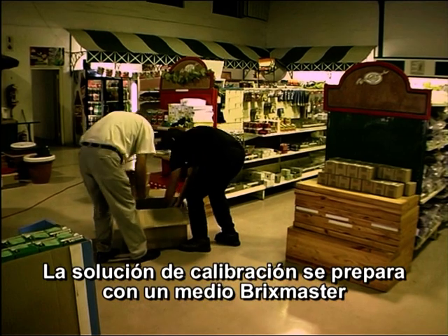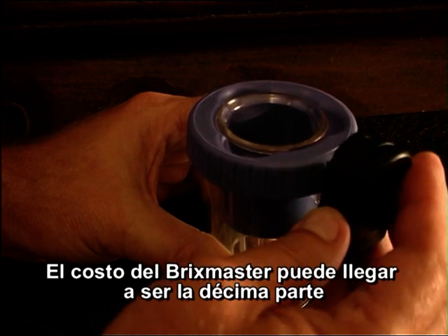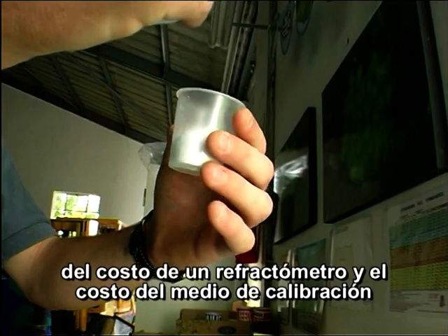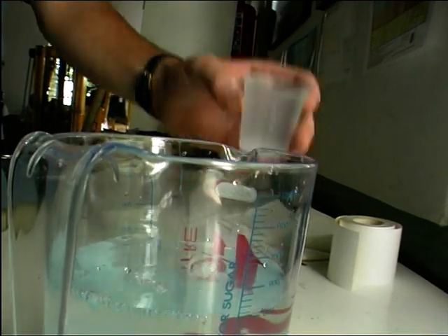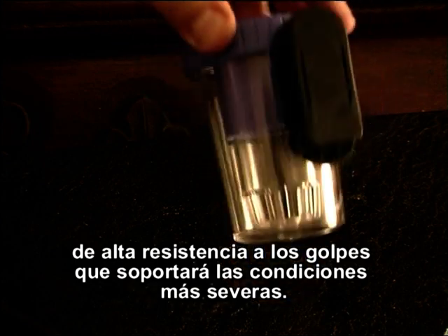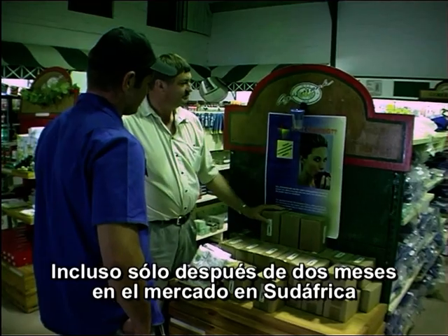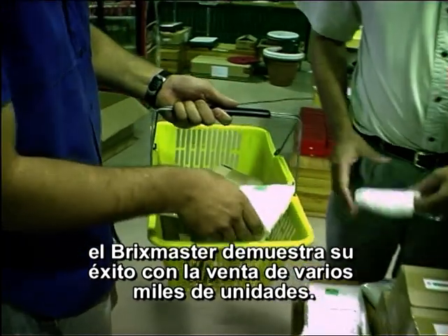The calibration solution is made up from a special Bricks Master medium, and this medium is sold separately. The cost of the Bricks Master is less than a tenth of the cost of a refractometer, and the cost of the medium is a few cents per picker per day. The Bricks Master is made out of high-impact-resistant polycarbonate that will withstand even the harshest conditions. Even after only two months on the market in South Africa, the Bricks Master has proven itself by sales of several thousand units.